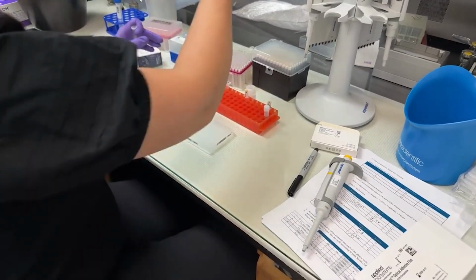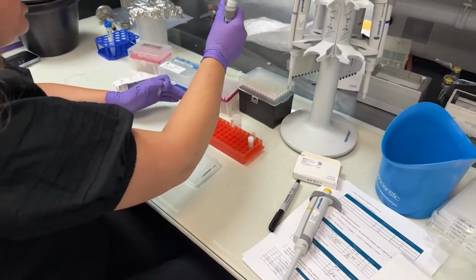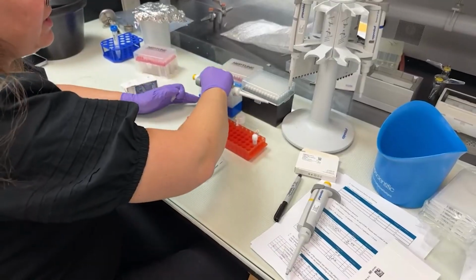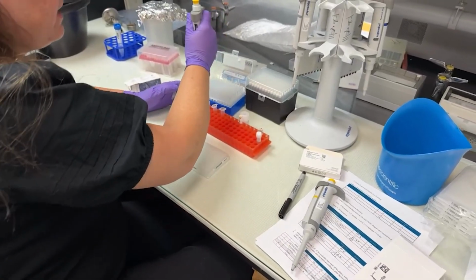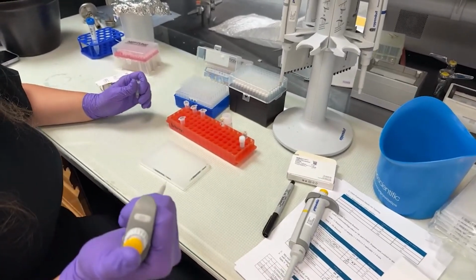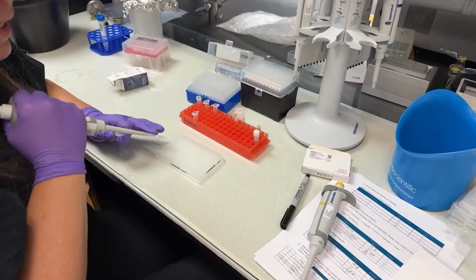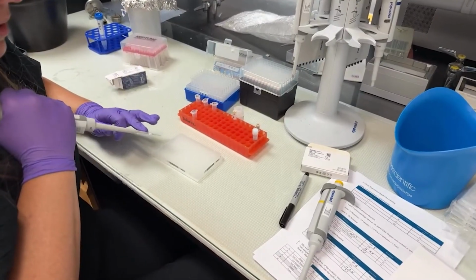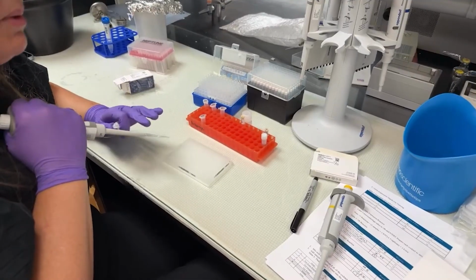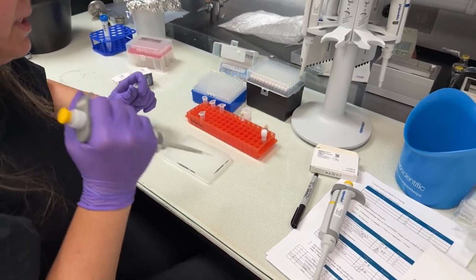Number one, it ensures that the reagents stay clean, so I'm not putting contamination into the reagents I want to keep reusing. Also, sometimes there can be liquid or other items that hang on inside the tip, so if you're doing repeated pipetting steps, they can become inaccurate if you're doing them in repetition.